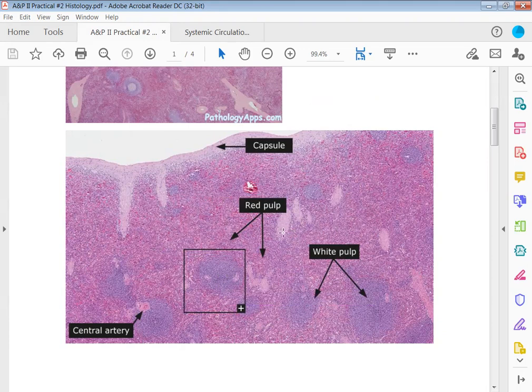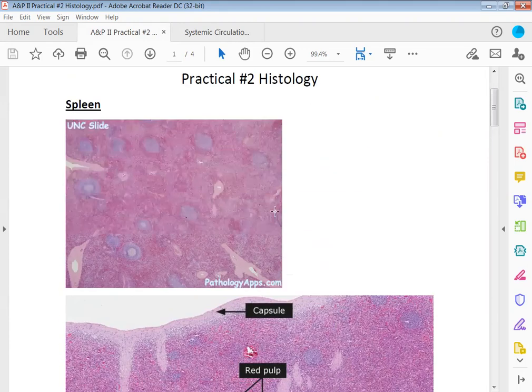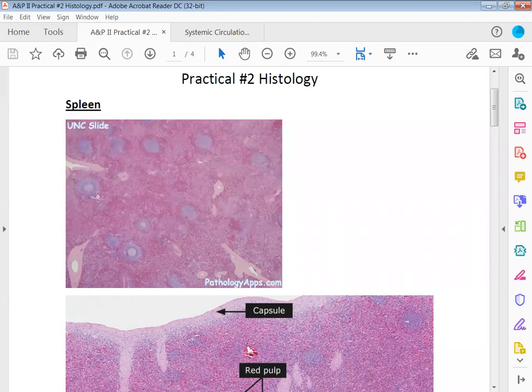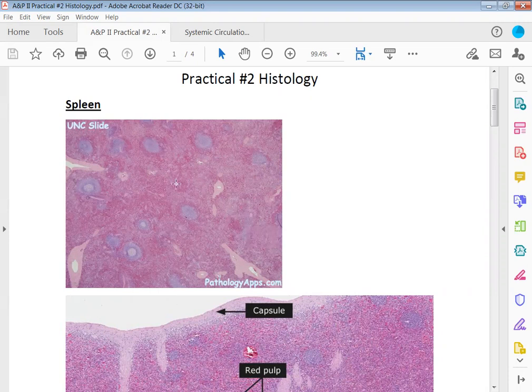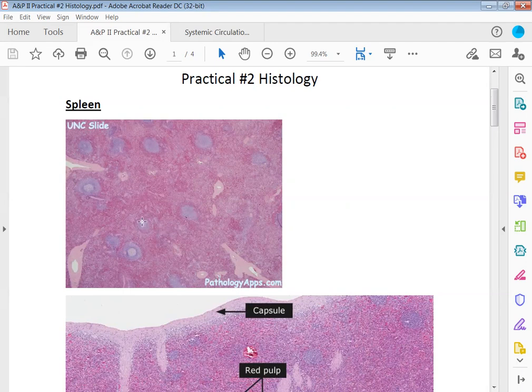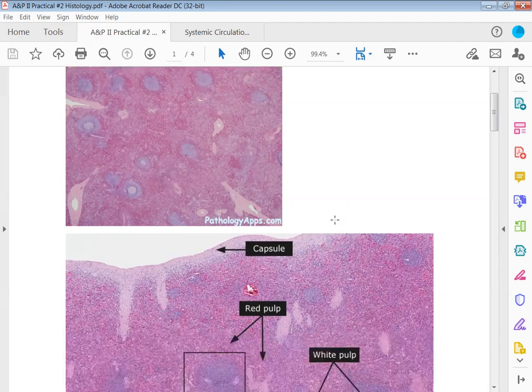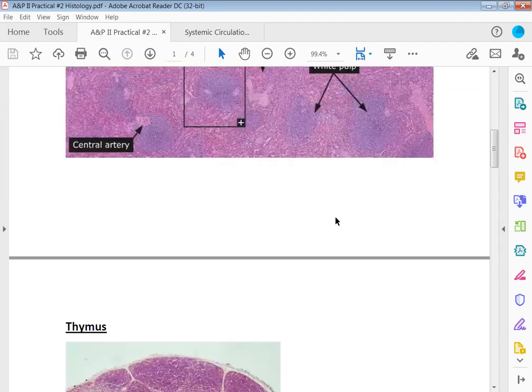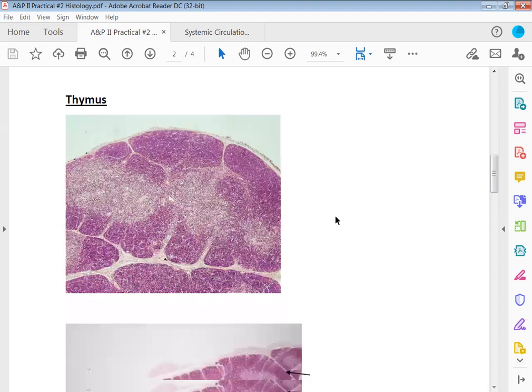Going back up here again, identify this organ or gland would be spleen. Identify this specific area out here would be red pulp. Identify this specific area here and here would be white pulp.